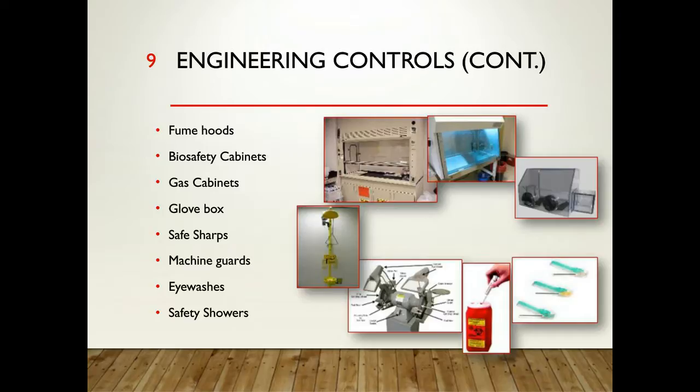However, you do need to check with your local building codes and wastewater rules before you push for that, because there may be regulations that don't allow for those kind of devices to be plumbed to the sanitary sewer. Are the safety showers accessible? Do they meet ANSI standards, as I mentioned earlier?